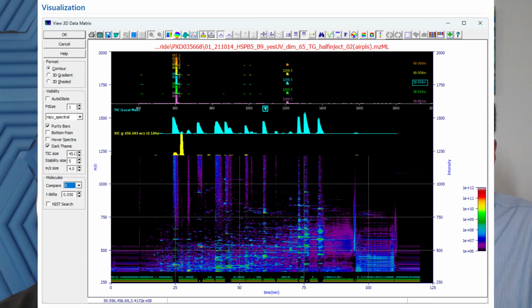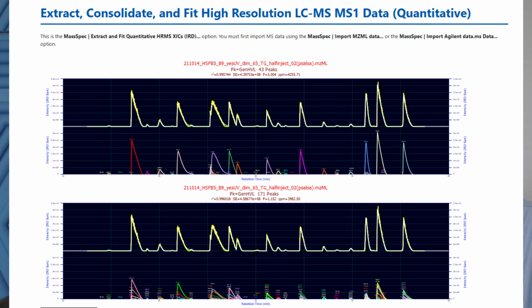Now, this is a mass spec trace where the chromatography is in the cyan, but you have all of this information in the mass spec. I'm looking at it here as a 3D profile. If you go in and use that, you can produce a different kind of separation where you're doing a peak fitting of each individual component, each individual extracted ion chromatogram. And if you're consolidating them correctly and conserving mass, which is something that hasn't been given a lot of attention, you can produce what's in this lower axis here, where you can see the individual components in the chromatography using the mass spec detector and determine their actual quantity.